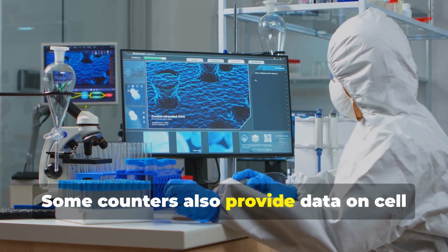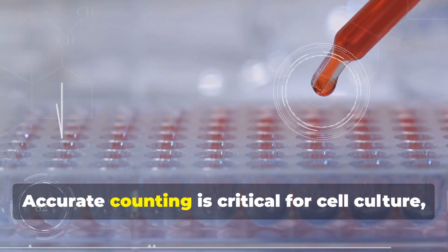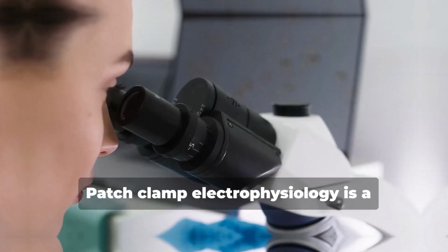Some counters also provide data on cell size and viability. They come in various types, including benchtop and handheld models. Accurate counting is critical for cell culture, flow cytometry, and drug testing.